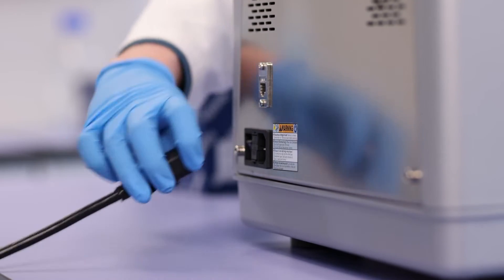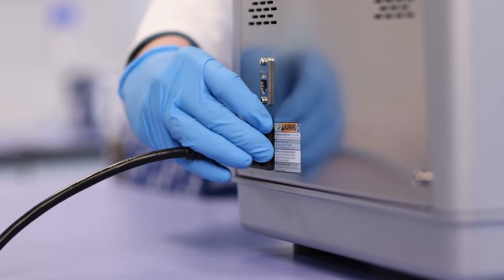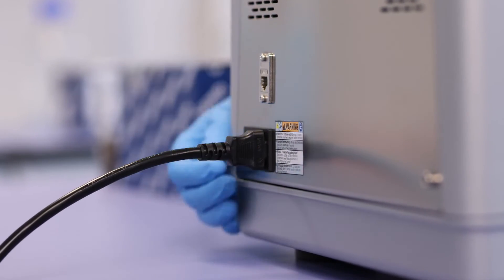Make sure the power switch is in the off position, then connect the power cord with the port next to the switch. Plug the other end of the power cord into a grounded power outlet.